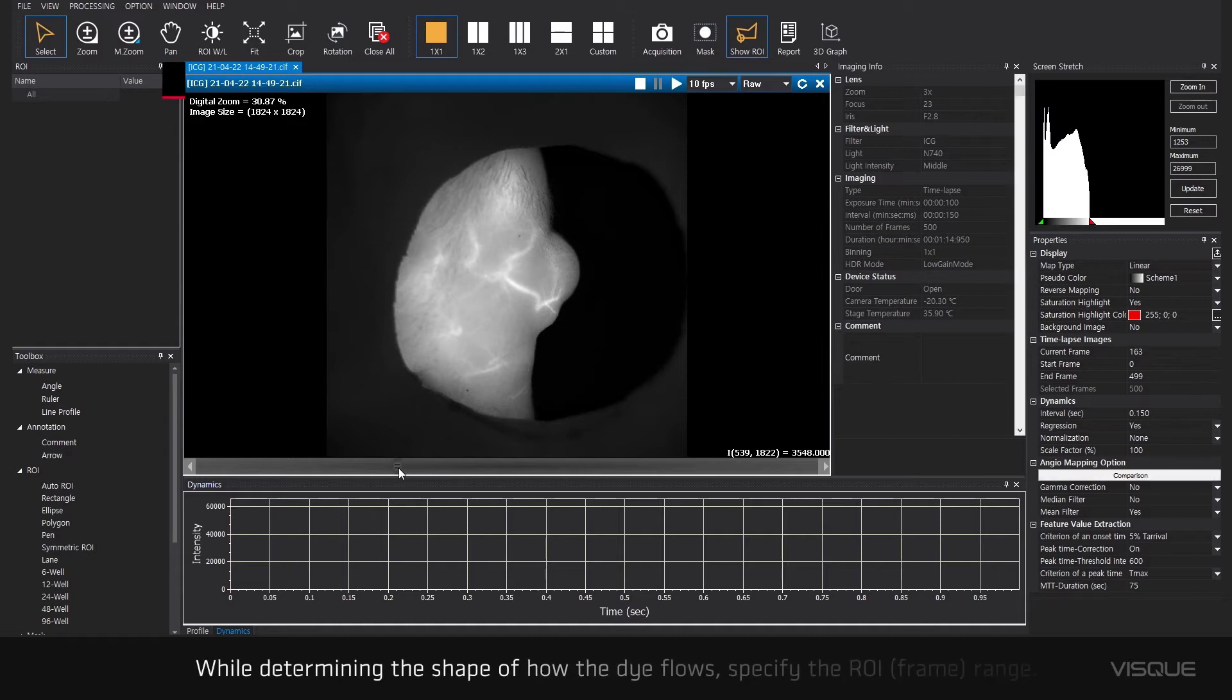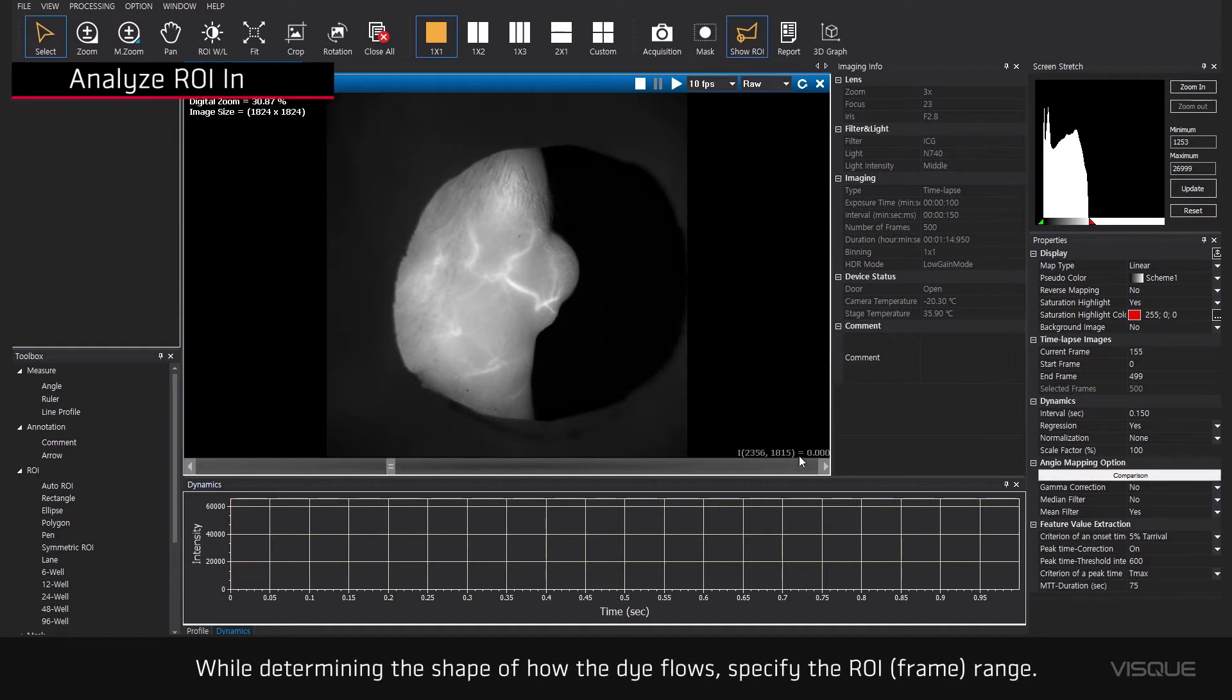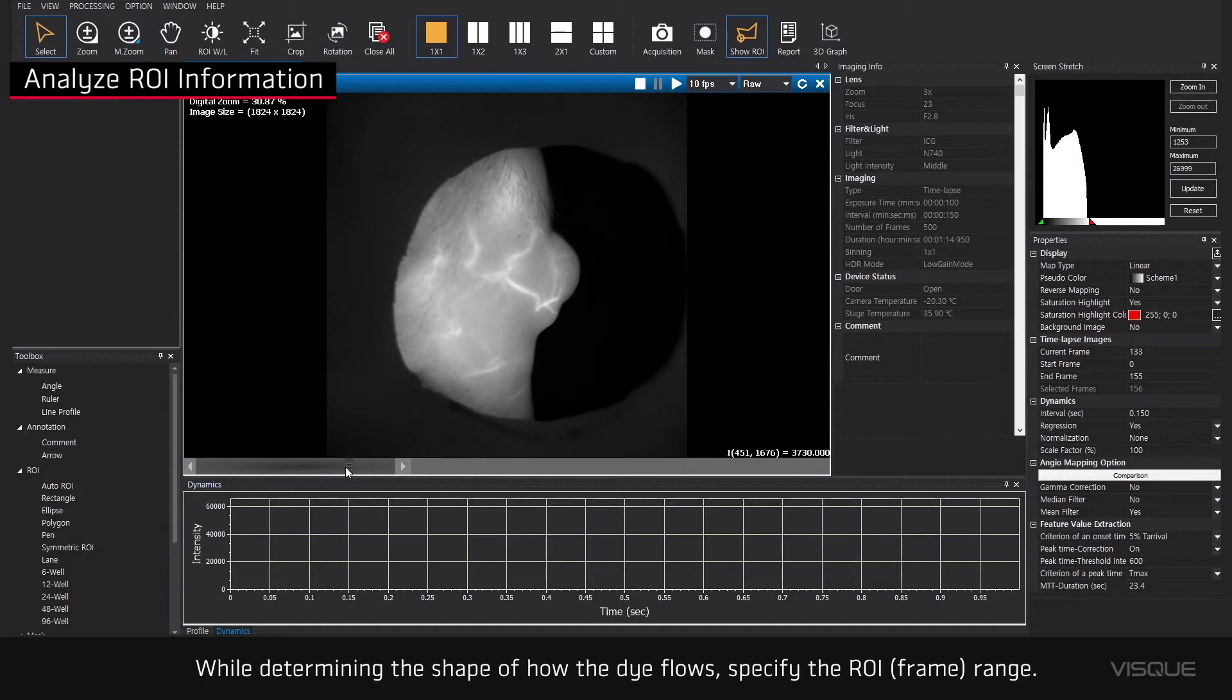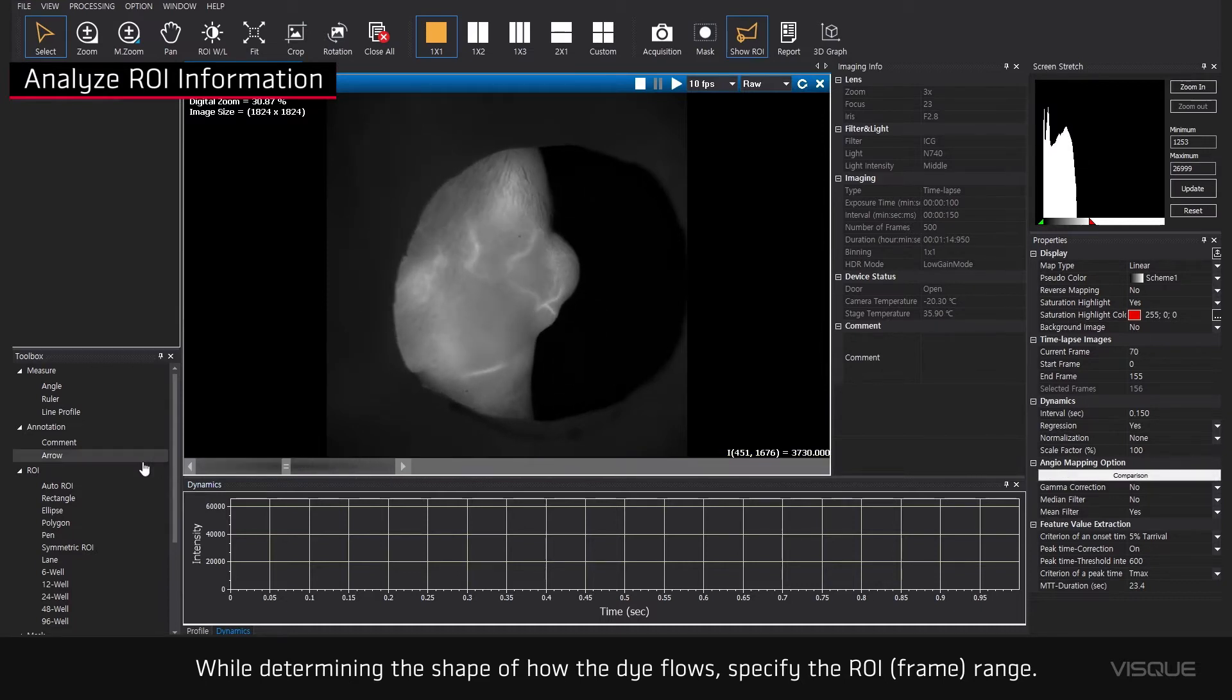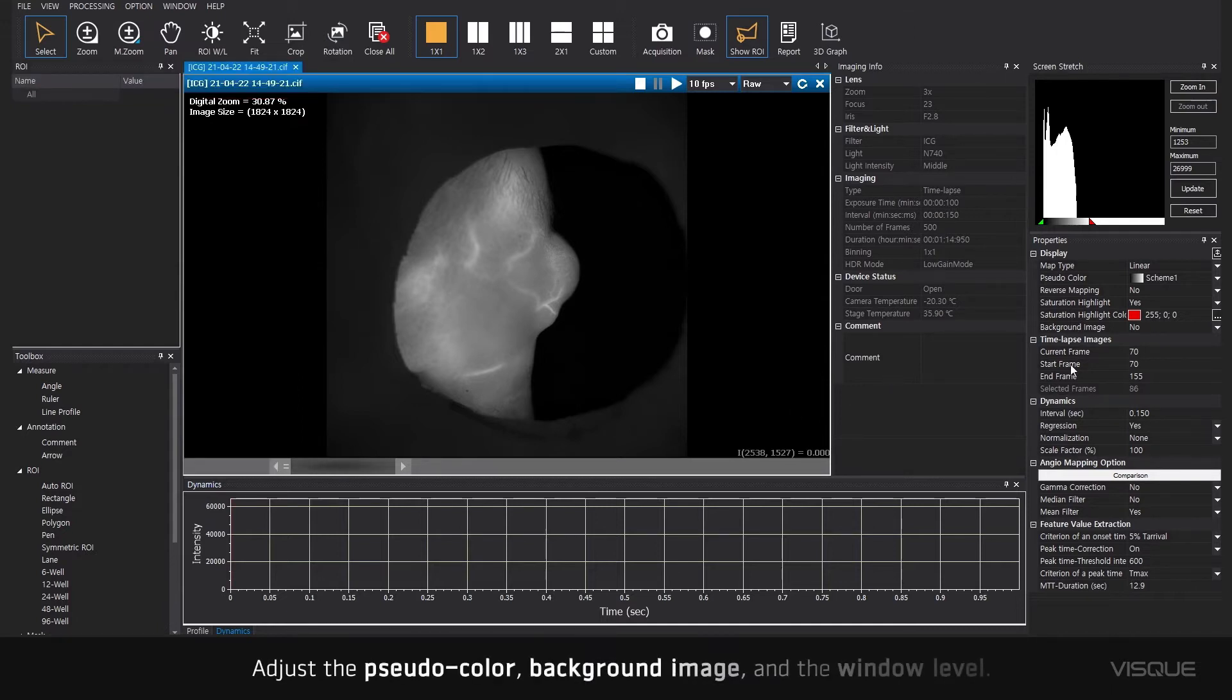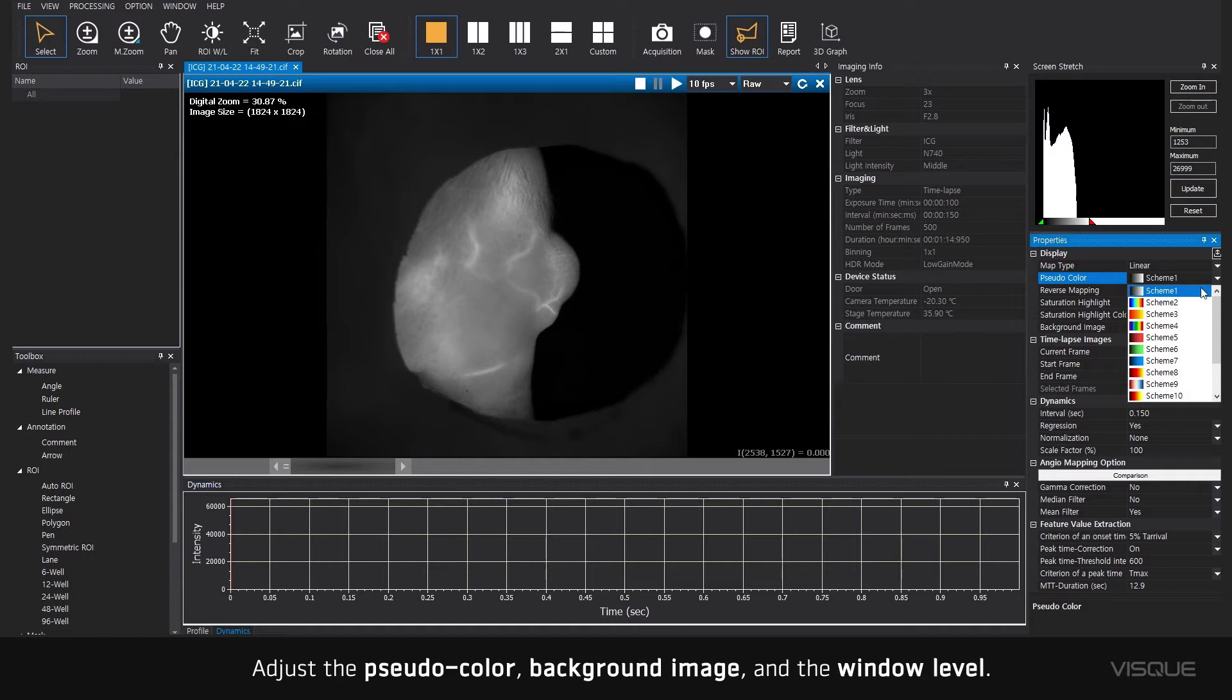Check the color region. While determining the shape of how the dye flows, specify the ROI range. Adjust the pseudo color, background image, and the window level.